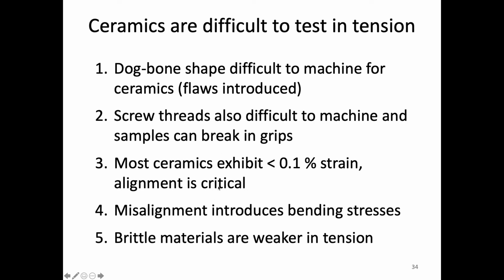Ceramics don't exhibit much strain because they're very brittle, and so alignment is very critical. If there's any sort of misalignment, that affects your test. It's no longer in uniaxial tension. And so alignment becomes absolutely paramount.